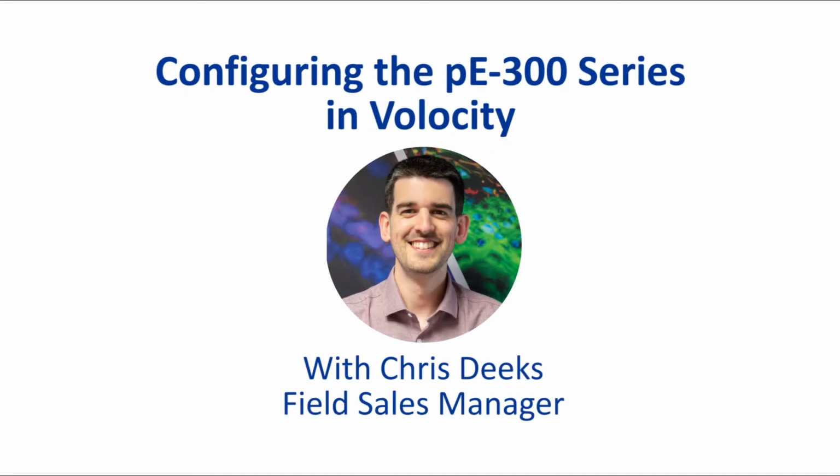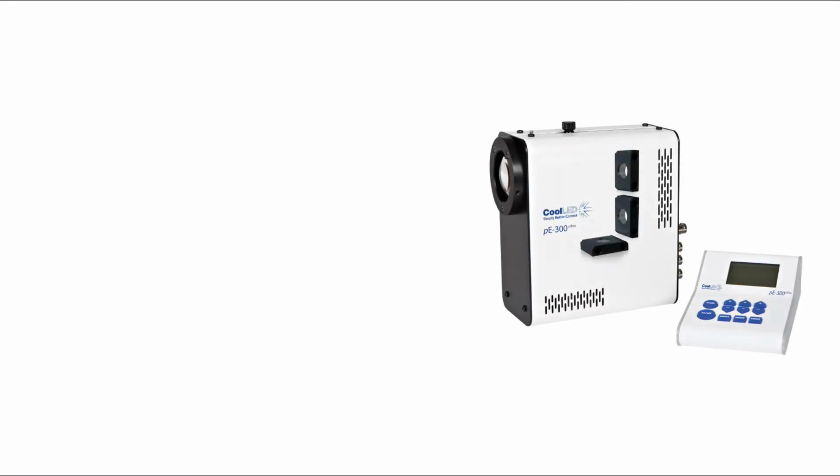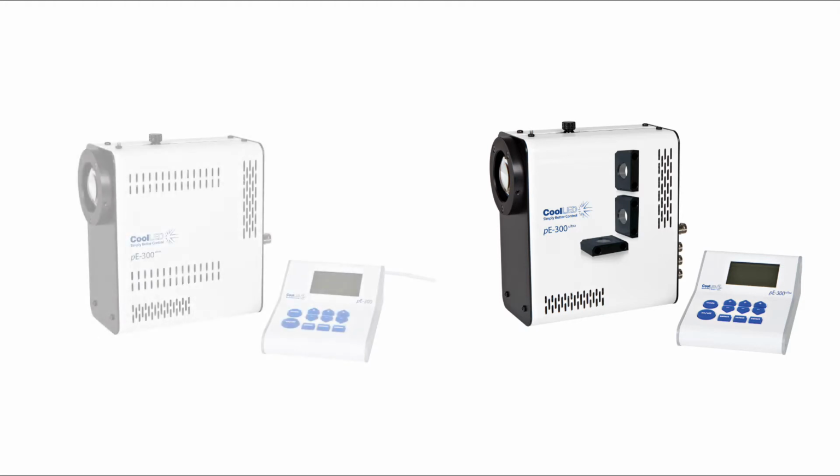Hello, welcome to this CoolLED video tutorial for integrating the pE-300 series into the Volocity software from Quorum Technologies. In this video we will show you how to set up and integrate a pE-300 Ultra into the software, but this setup also applies to a pE-300 White and the method is exactly the same.